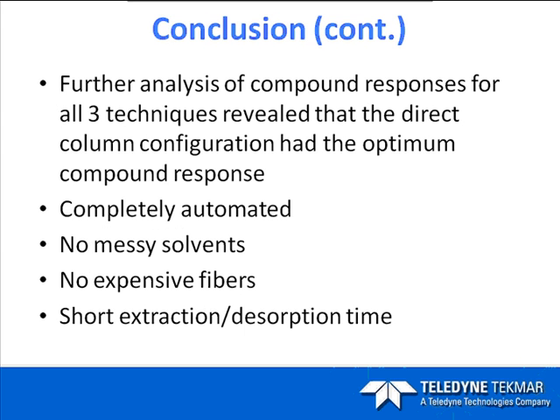Further analysis of the compound responses for all three techniques revealed that the direct column configuration had the optimum compound response. If we can remember back, we had an area response of about 425 to 450,000 for the direct column. We had only about 140,000 for the 10-to-1 split, and about 225 to 250,000 for the cryofocusing module.